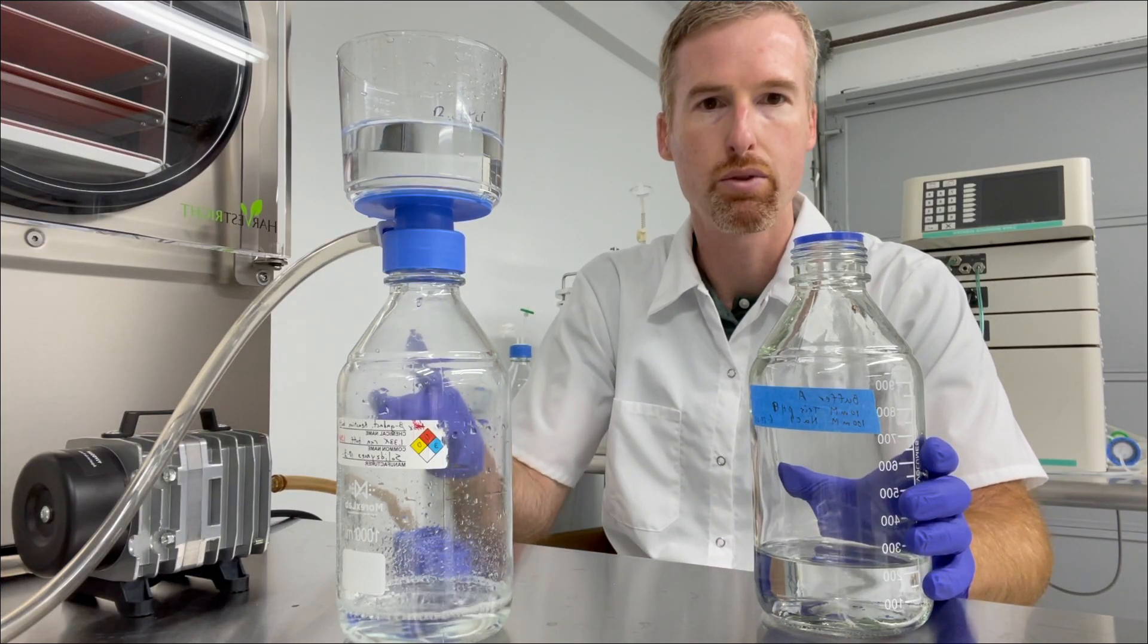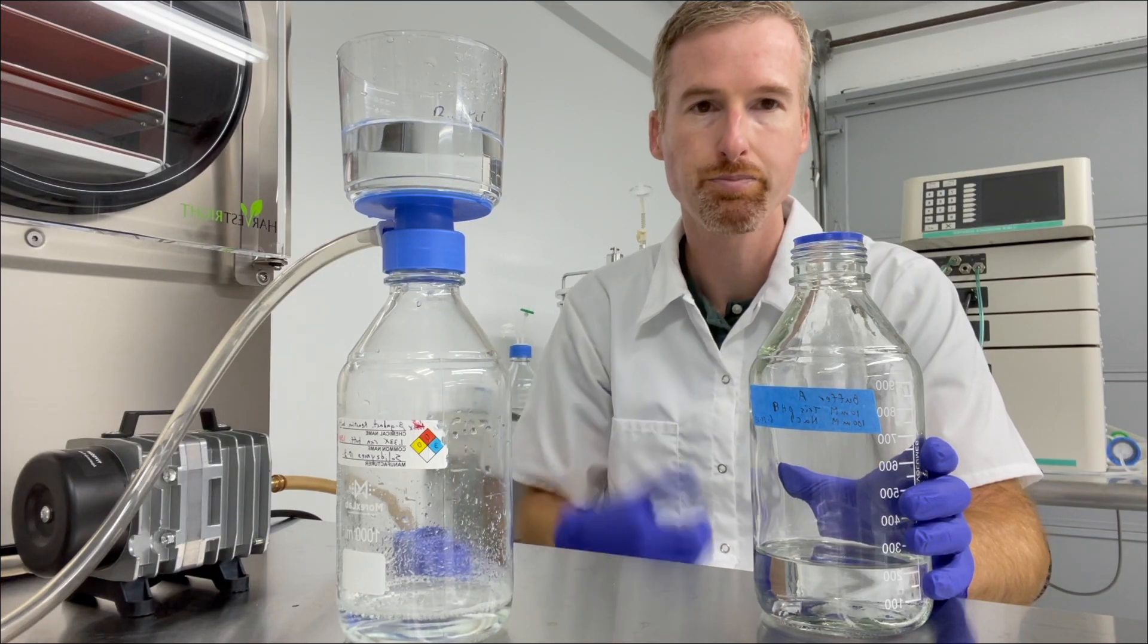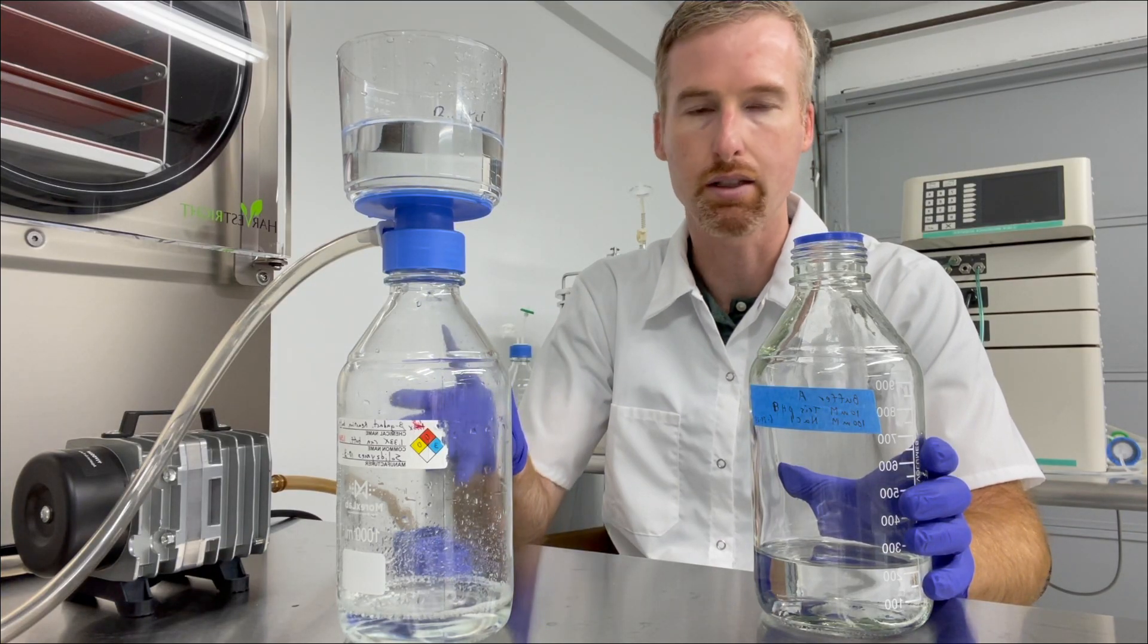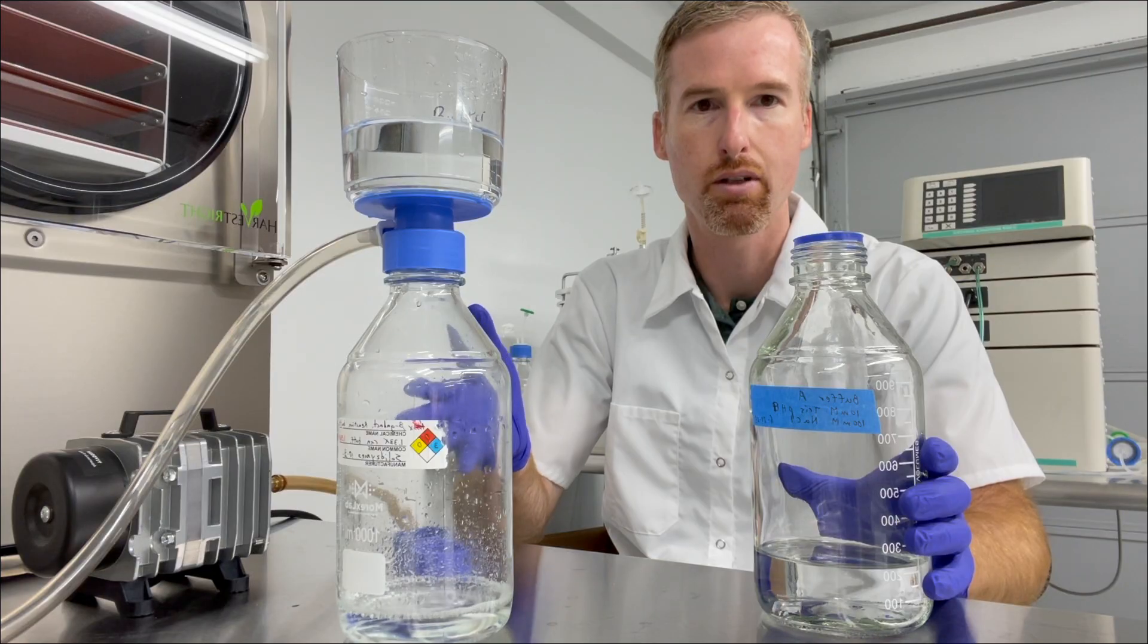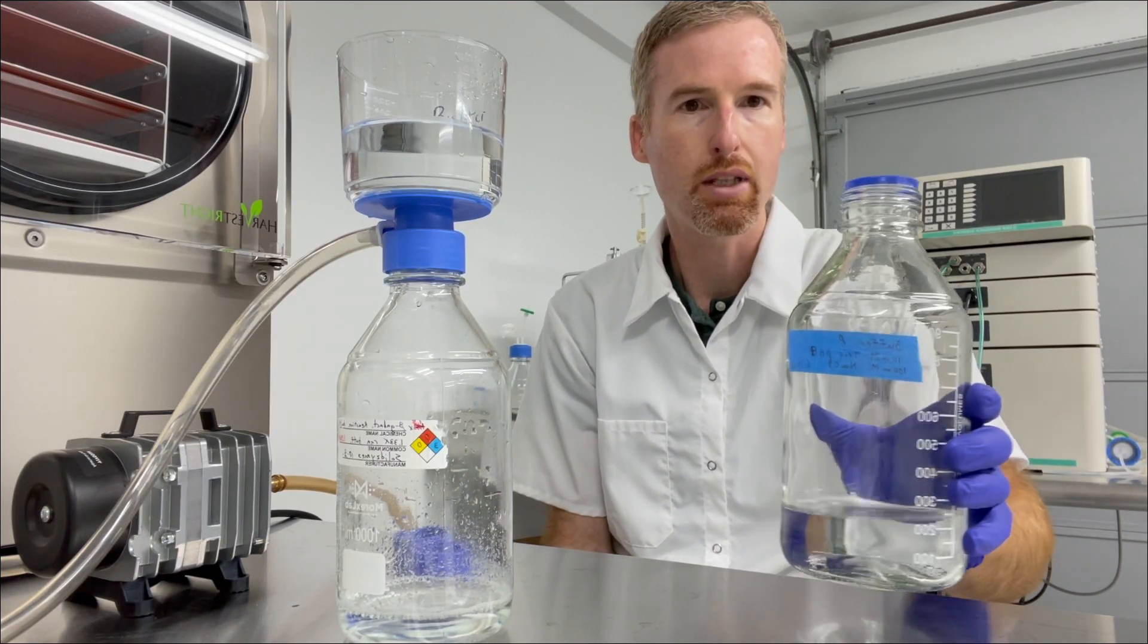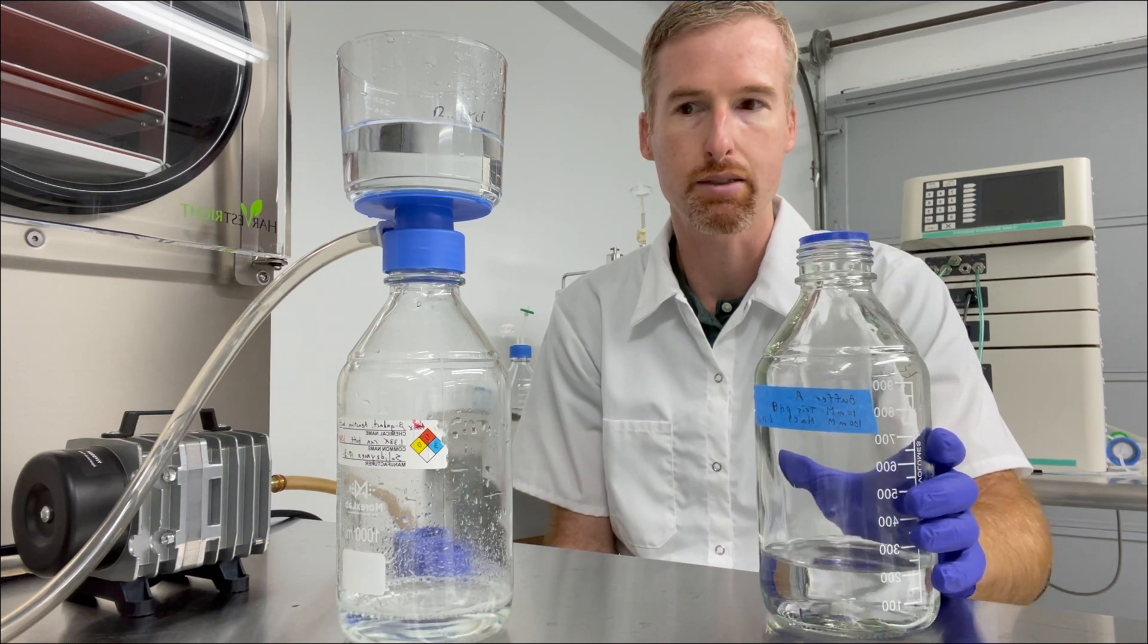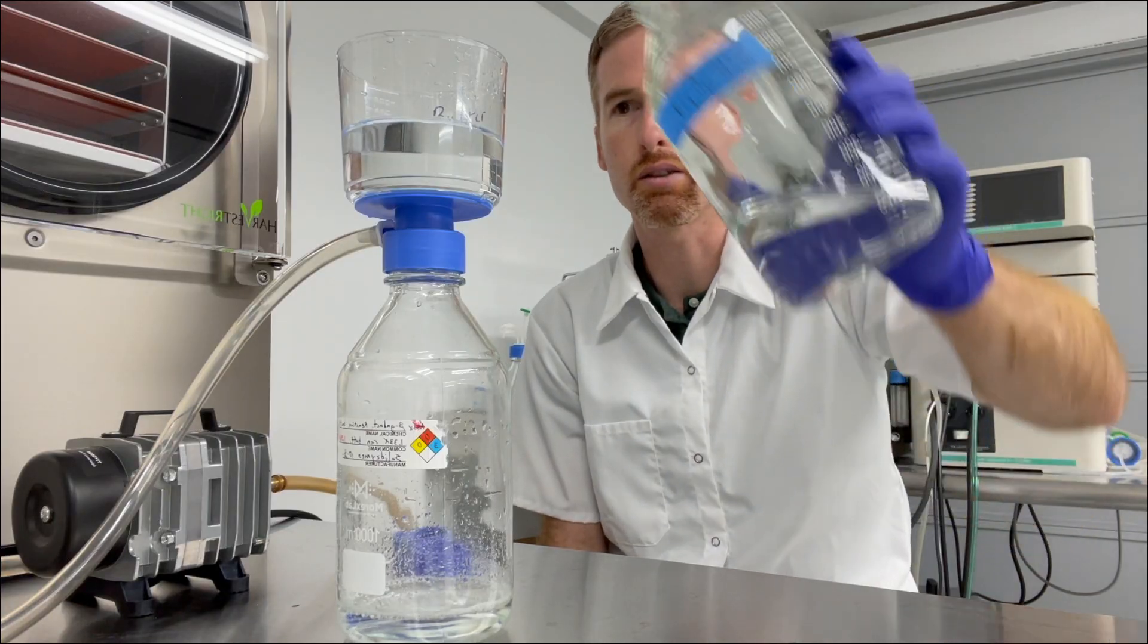Pull it through into this other bottle using the vacuum, collect the clean degassed buffer on the other side, and I'm just going to repeat that for buffer B and for water as well because I need water for the ACTA. So let's go ahead and see how this goes.